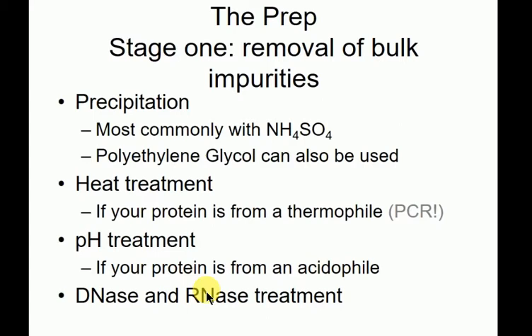But for something like the French press, by the time your lysate comes out, it'd be very stringy because the strands of DNA haven't been broken. And the viscosity of DNA is amazing. If you've ever seen a solution of DNA, it just pulls the liquid with it. So in order to make your sample malleable and usable, you probably add a few little grains of DNase.